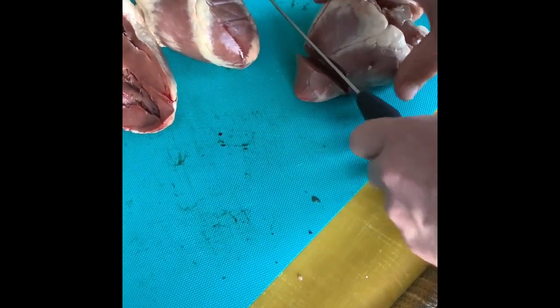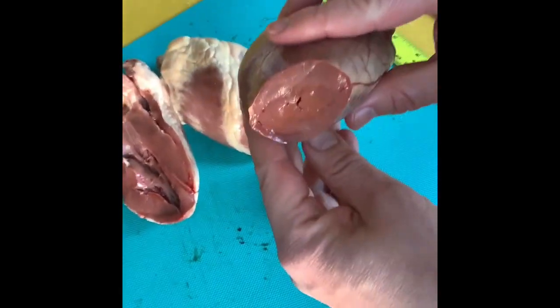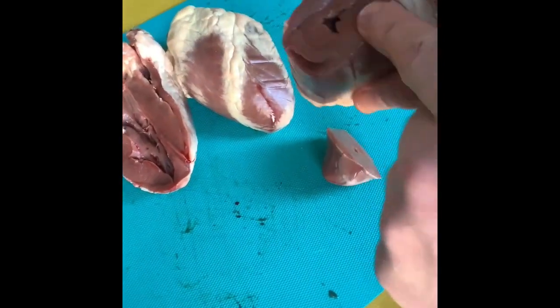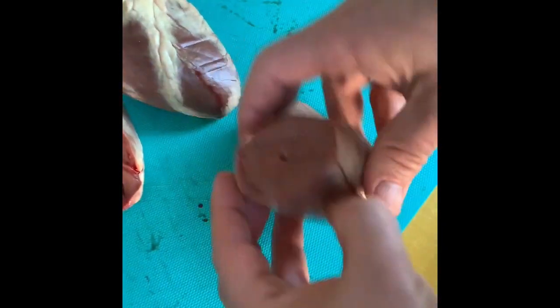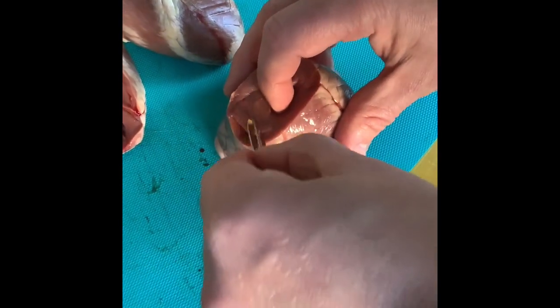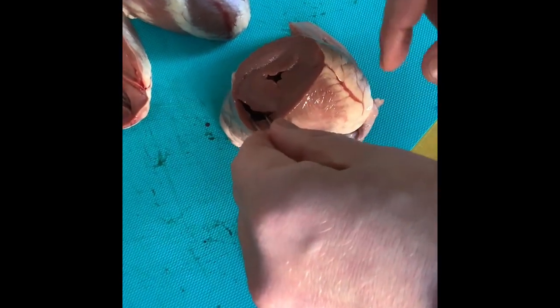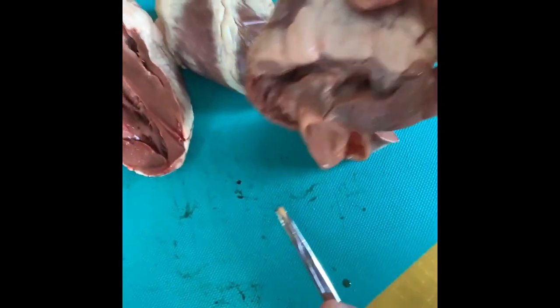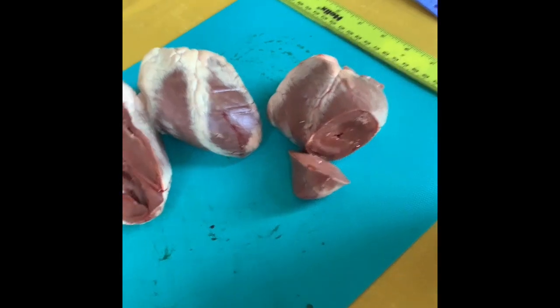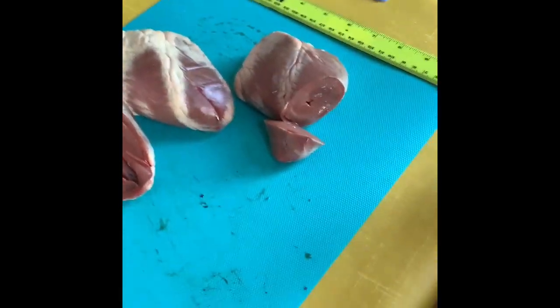Looking at another heart now — if you look at the gaps here, this is where the blood would be in the left ventricle, and all this muscle surrounding it. This is where the blood would be in the right ventricle — look how thin that wall is compared to the muscle on the left. That really shows the difference, because the left side has to pump all the way to the rest of the body, whereas the right side only pumps to the lungs, which are right next door.